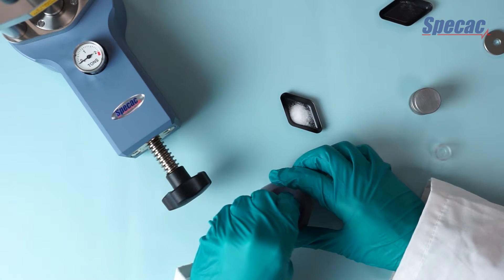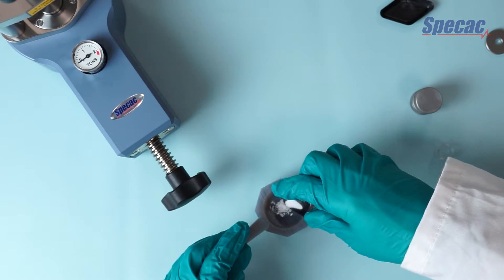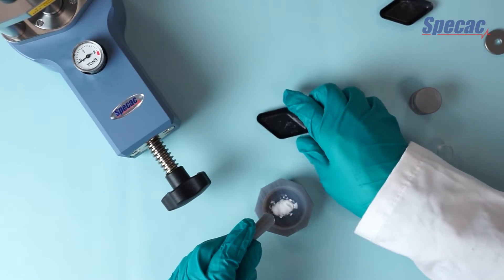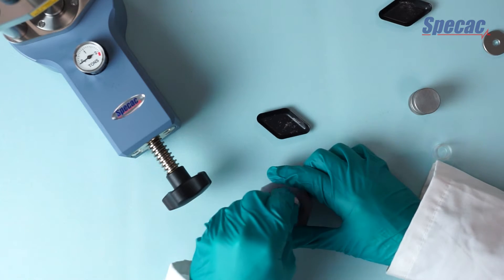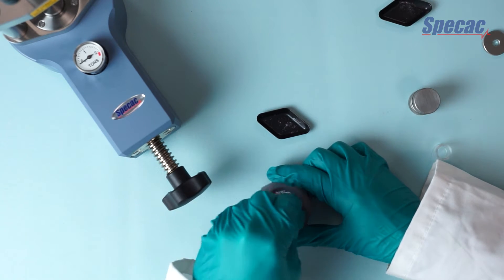We use the pestle and mortar to grind them into a homogenous mixture. We don't want to grind them too much or too long because that opens up the crystal facets of the KBR powder to moisture and will show up in our spectra. So just gentle grinding for a few minutes to mix them together thoroughly.